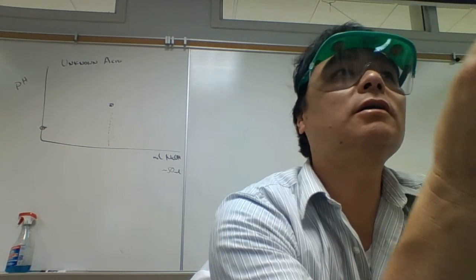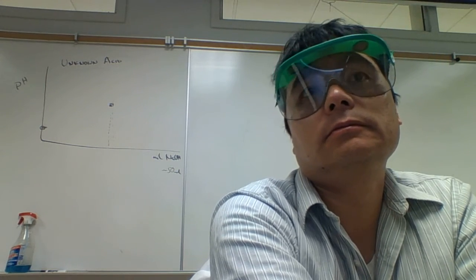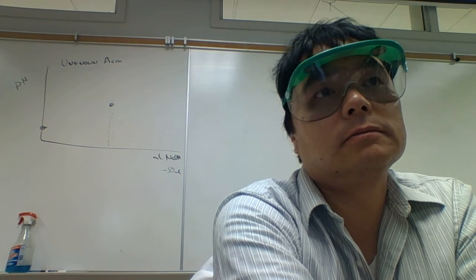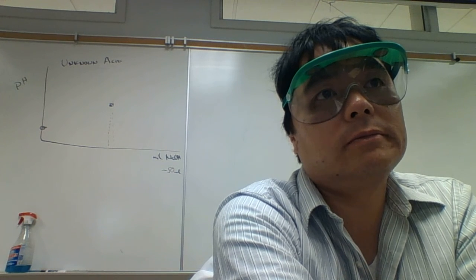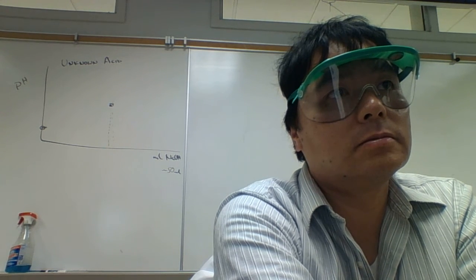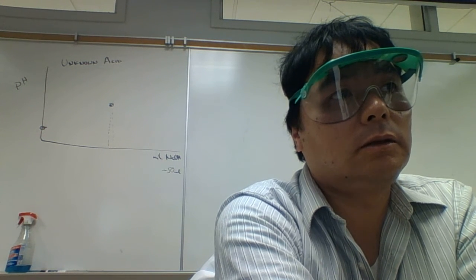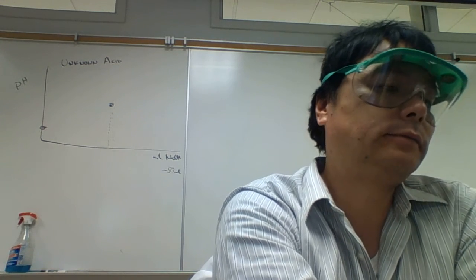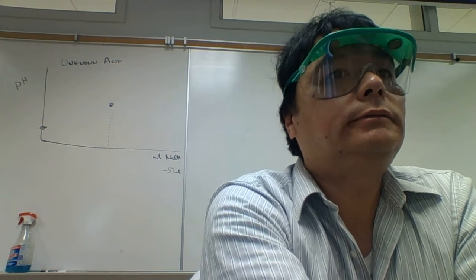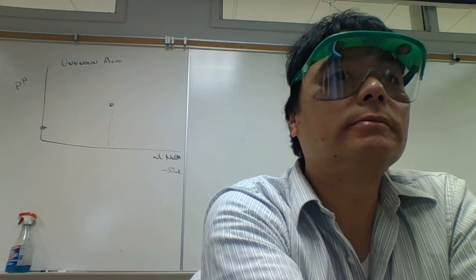All right, get a wash bottle of fresh DI water. All right, turn on your LabQuest system.